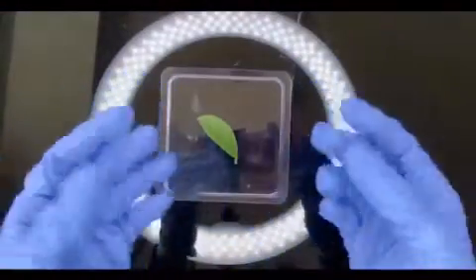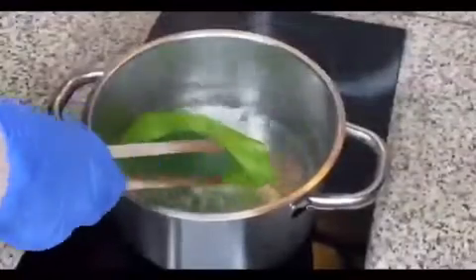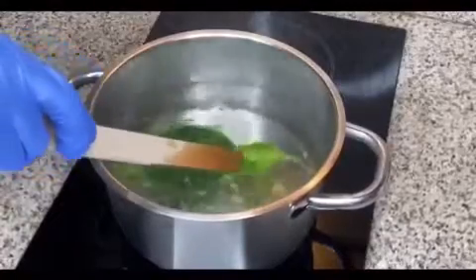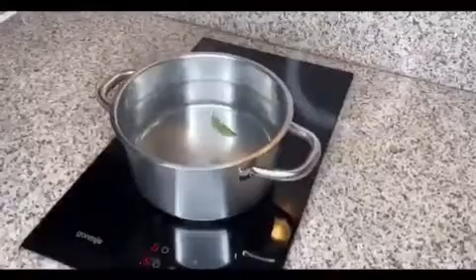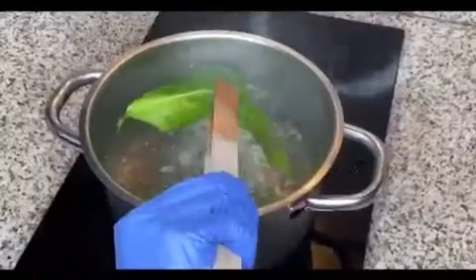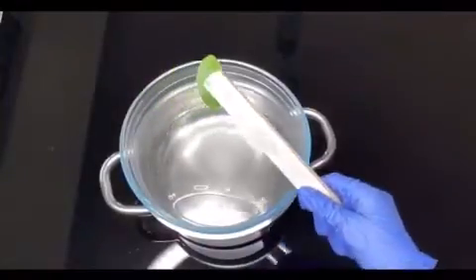I have my gloves and goggles on, so now we're ready to start the experiment. First, I will put the leaves in boiling water for about one to two minutes so the heat can remove the cell membrane. Then I'll take out the leaf with tweezers — I didn't have metal ones, so I used wooden ones.